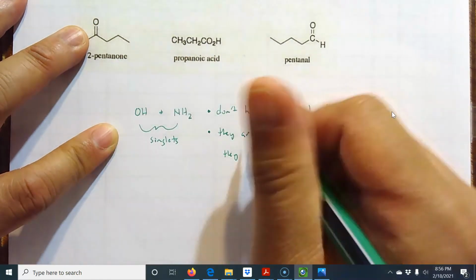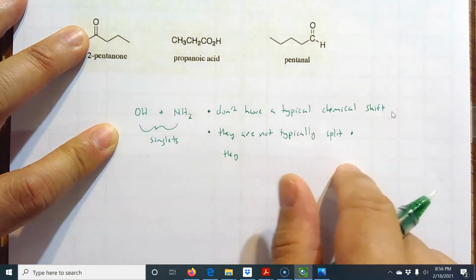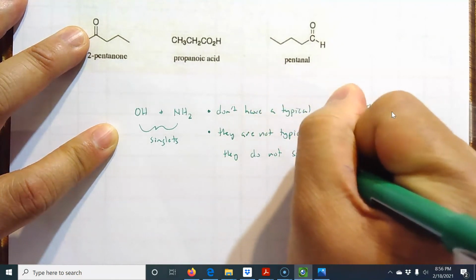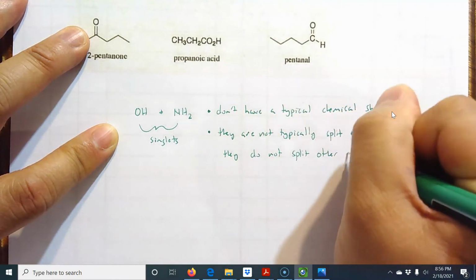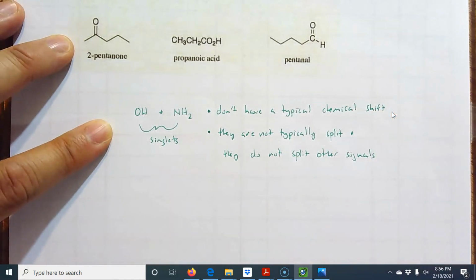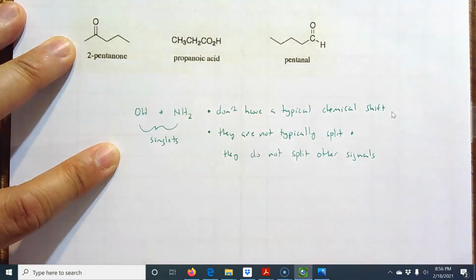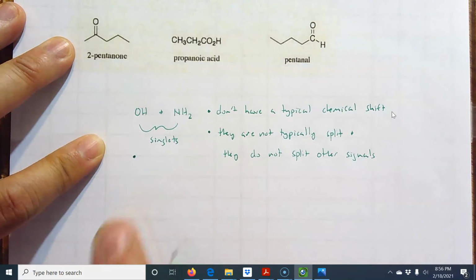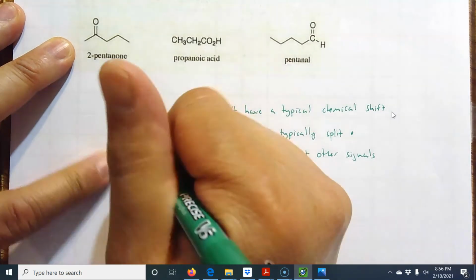Okay, so they are not typically split, and they do not split other signals. Okay, the next thing, bullet point number 3, and I'll put it underneath here because not only is that peak a singlet, but it's typically broad.